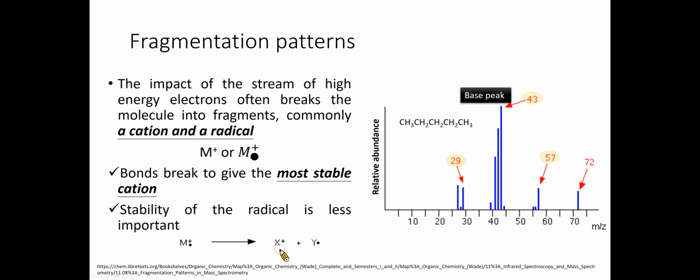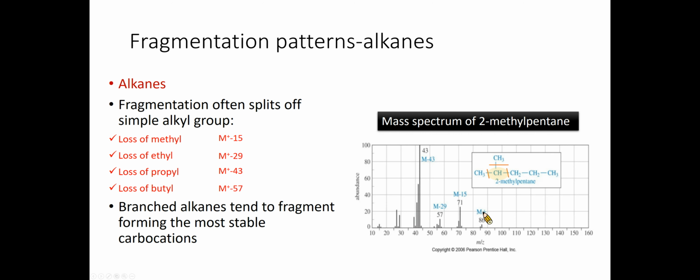The ion X+ will travel through the mass spectrometer just like any other positive ion and will produce a line on the stick diagram. All sorts of fragmentation of the original molecular ions are possible, and that means that you will get a whole host of lines in the mass spectrum. For example, the mass spectrum of pentane looks like this, where the yellow shades highlight the fragments of pentane. In the following slides, I will introduce the common fragmentation patterns that can be found in each molecule class.